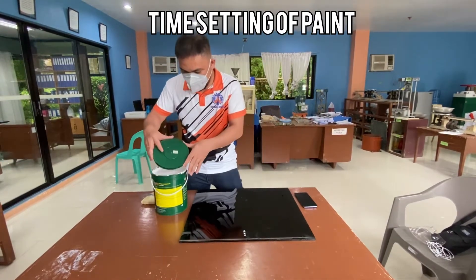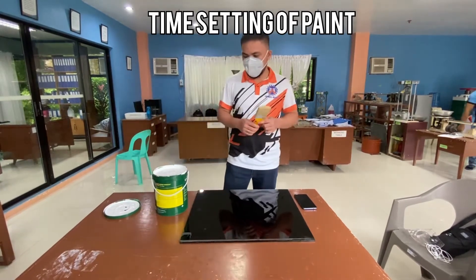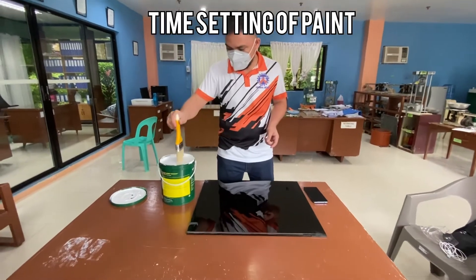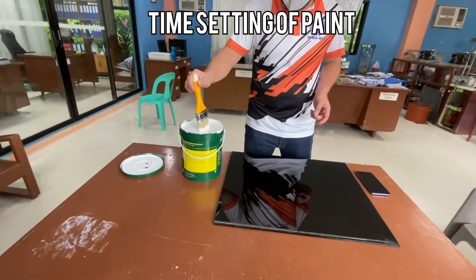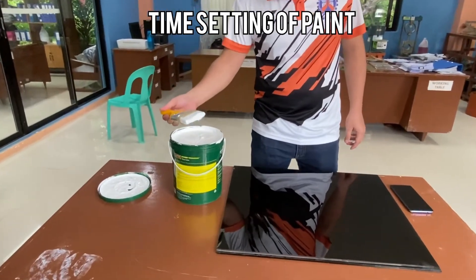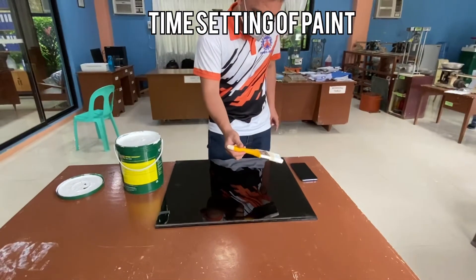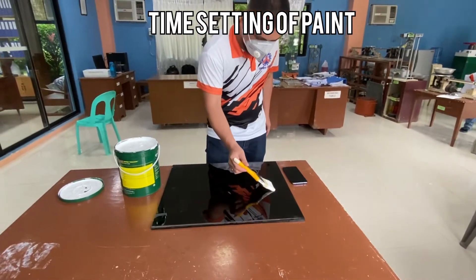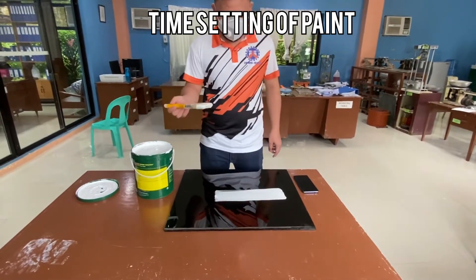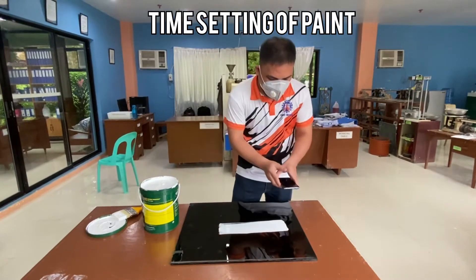So I will be performing the test now. First, dip the paintbrush into the paint. Then apply one stroke — one stroke and one coat. Then set the timer.